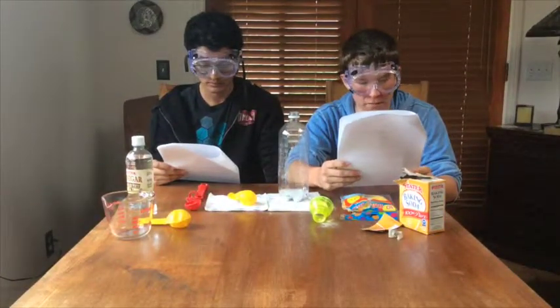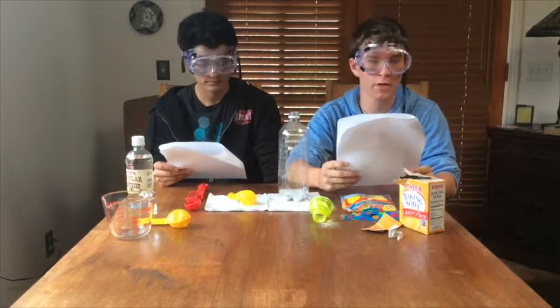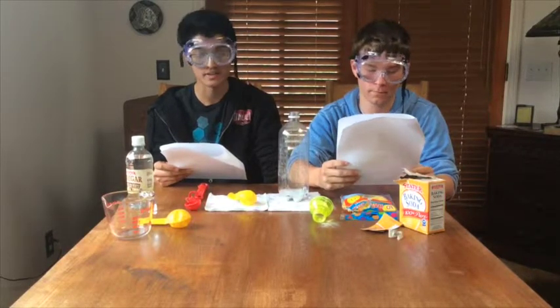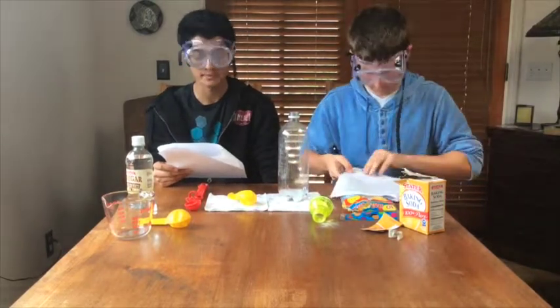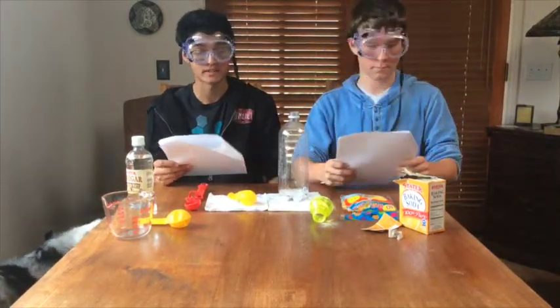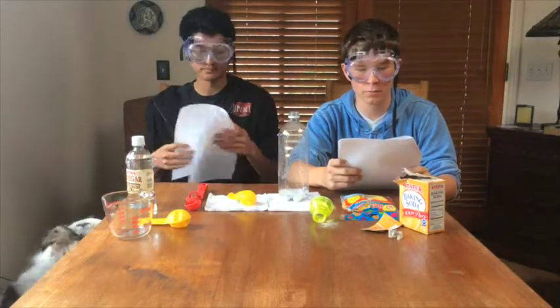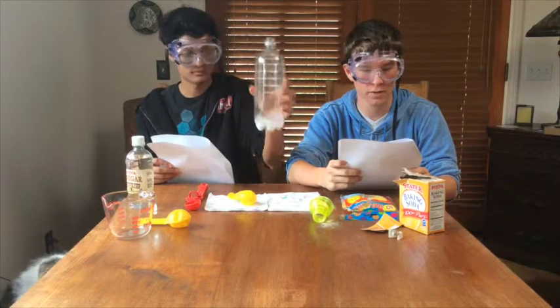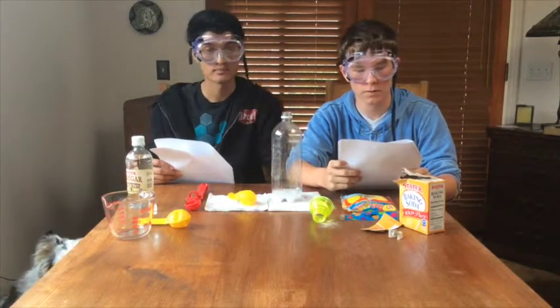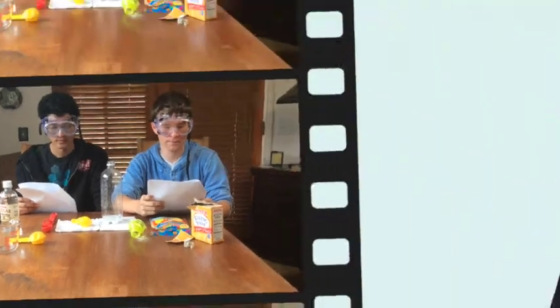Now that we have finished this reaction, we need to make any final observations about appearance and any other characteristics that are different from when we started. Make sure that everything is cleaned thoroughly and in a safe manner. It is just as important to clean up safely as it is to prepare for and conduct an experiment safely. To properly clean up this experiment, we disconnected the balloon from the bottle, letting all the gas release into the atmosphere. Once this was completed, we could dispose of the balloon in the nearest trash can.